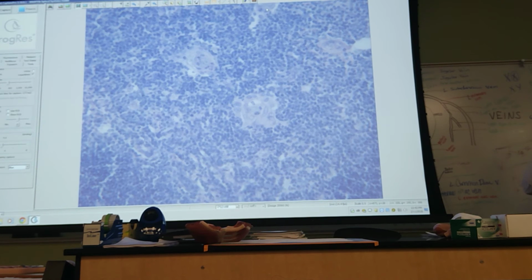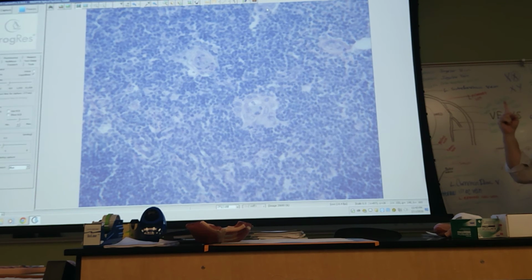One of their very favorites is to give you both a central artery and a thymic corpuscle and have you identify them. Since I've been standing here a few gazillion years, I know this presents a challenge to many students.